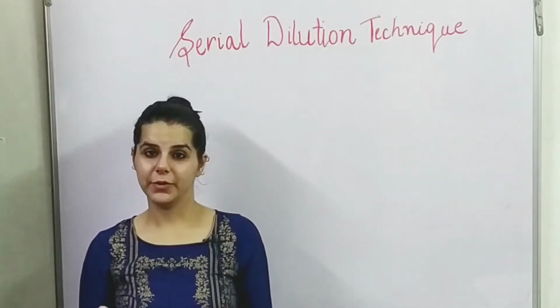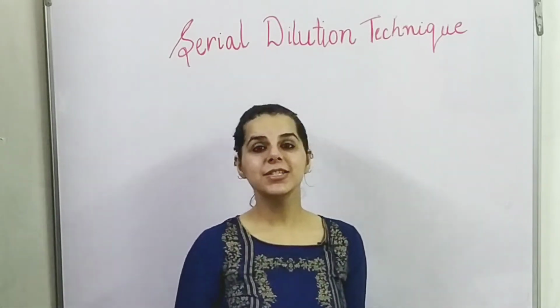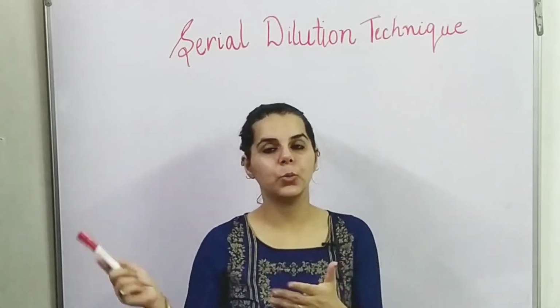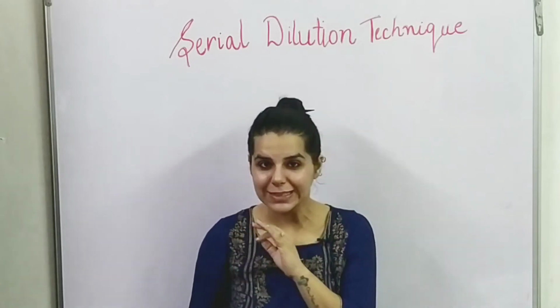I'm Dr. Shuchita Verma and today I'm going to talk about another very important topic, that is serial dilution technique. Now the serial dilution technique is also known as viable plate count method. And why do we do this serial dilution technique in microbiology?